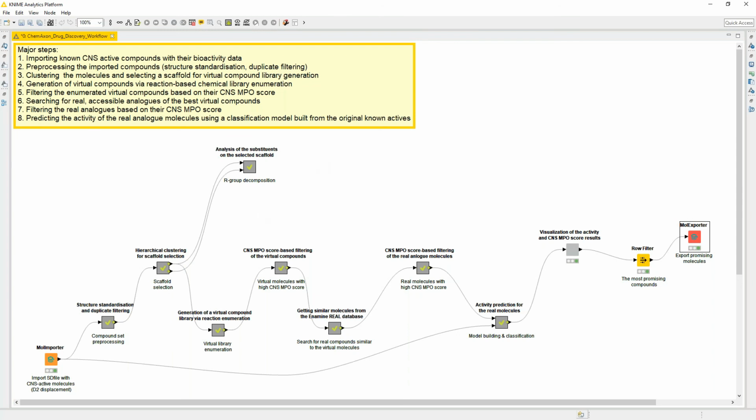I don't think there are any questions, Dora. So I guess we can go ahead and just create one of the meta nodes, if that would be feasible. Yes, we can. However, another thing that I had in mind is that we can try to modify one of the existing meta nodes. Okay.